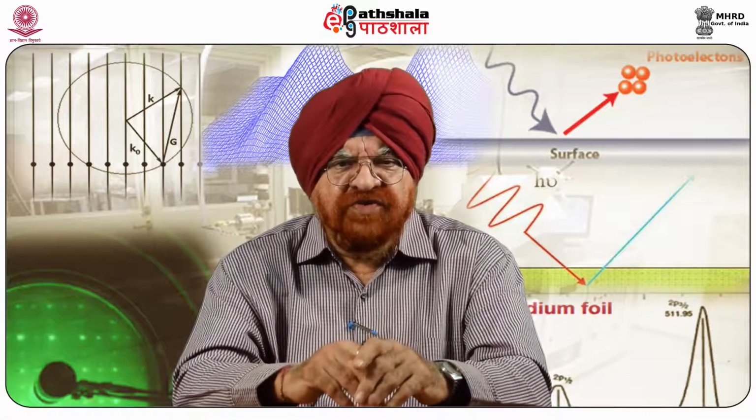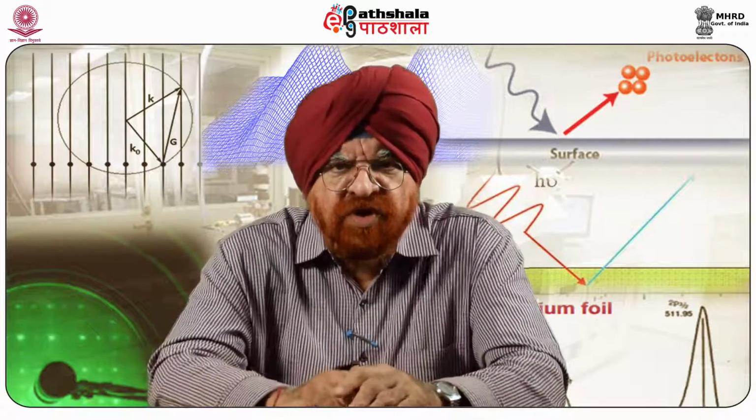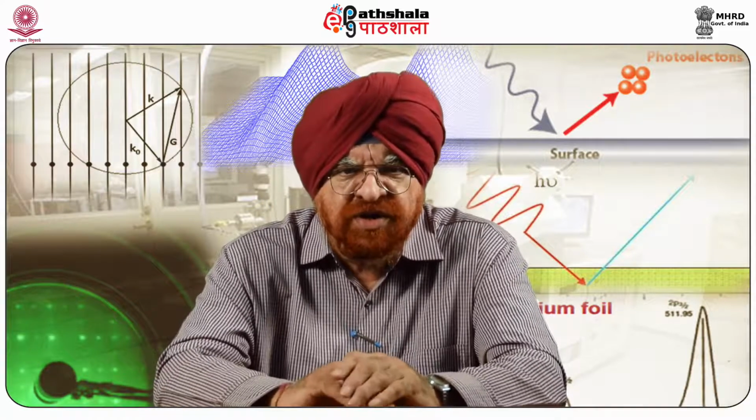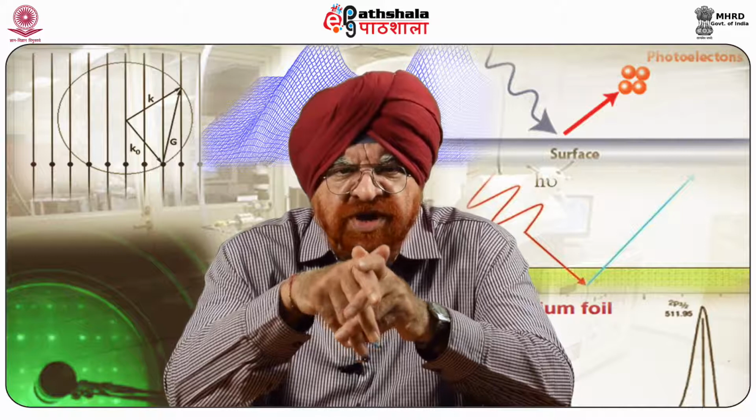The interpretation of images acquired by MFM requires knowledge about the specific near-field magnetostatic interactions between the probe and the sample. Therefore, this subject will be briefly discussed hereafter. That is, in what way the interaction will be monitored and what the changes are.